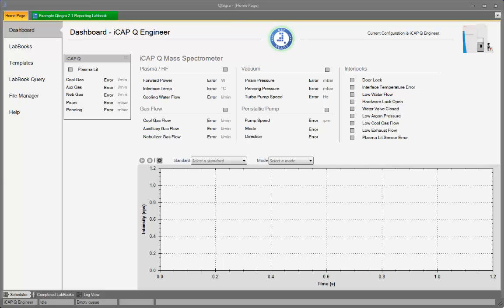Hello and welcome to QTEGRA Intelligence Scientific Data Solution. In this short introductory video, I will provide a brief overview of the reporting features in QTEGRA ISDS. I will demonstrate the new reporting features using an example QTEGRA labbook that has already been acquired.